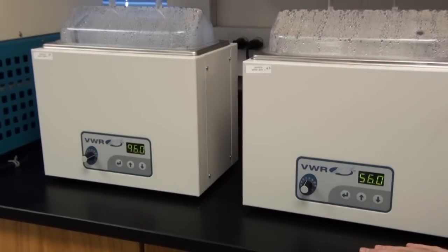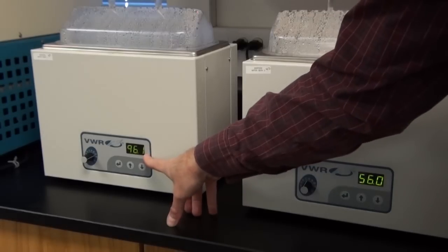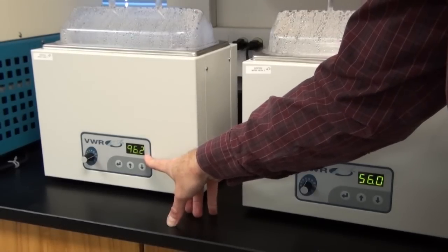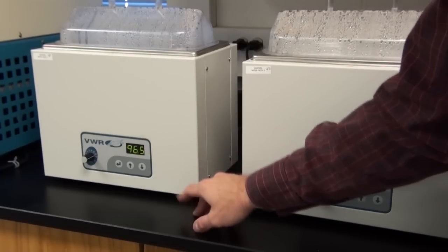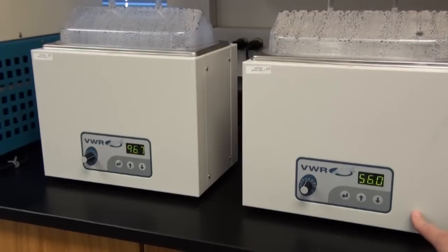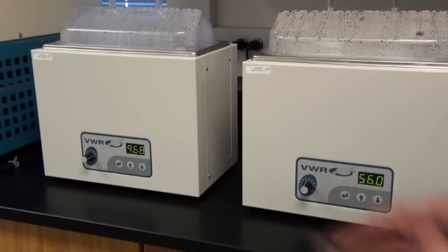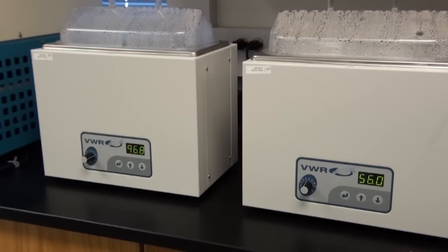There should also be two water baths in your lab. One should be set at approximately 56 degrees Celsius, and another one that should approach 100 degrees Celsius. This particular instrument doesn't actually get up to 100 because it's boiling, but it should get up to approximately 99 degrees. The point of the 56 degrees is to dissociate your cells. So after you centrifuge your cells down, you're going to need to disperse them, break them open. So you'll incubate for 10 minutes at 56 degrees.